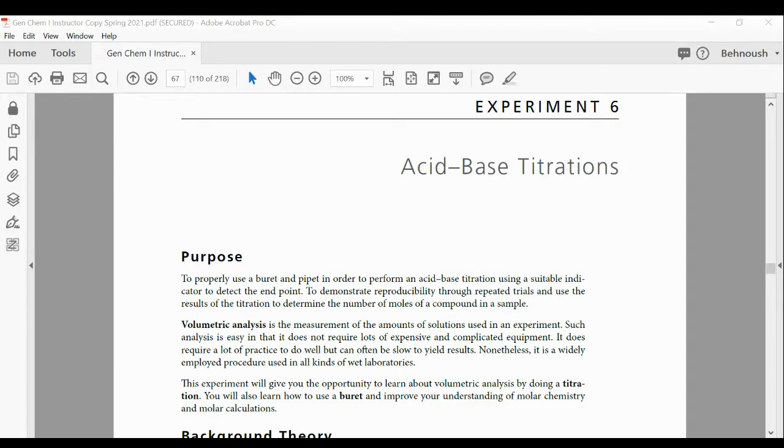Okay. So what is equivalence point? We have 2 points in titration. One is the endpoint of reaction, and the other point is the equivalence point. The endpoint of the reaction and the equivalence point are often used interchangeably, and that's not 100% accurate. It depends on the choice of the indicator. As you noticed here, some of your responses refer to the equivalence point, not the endpoint of the reaction.